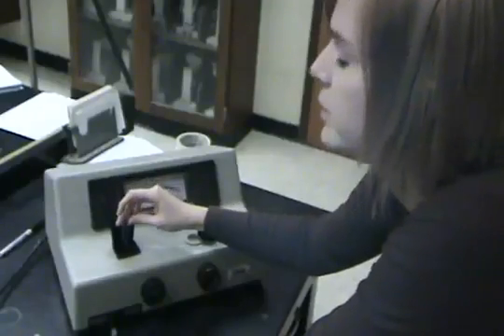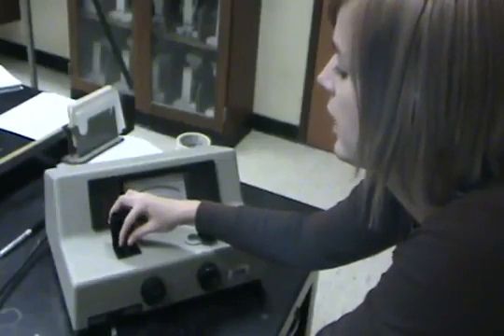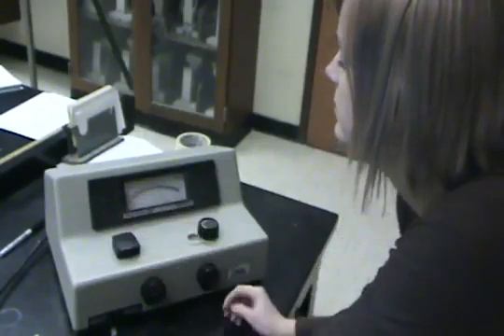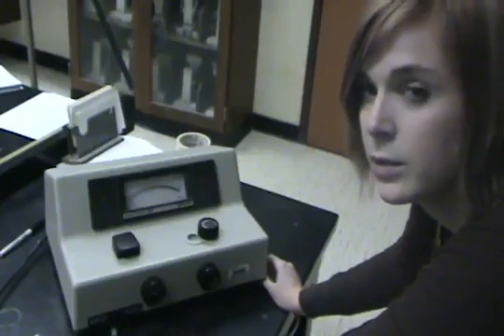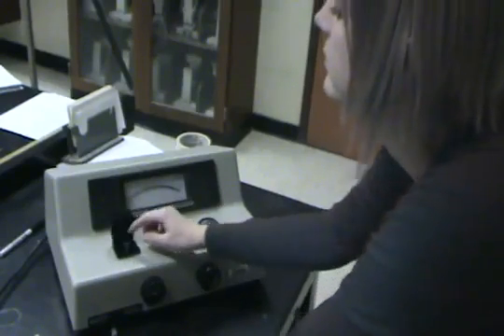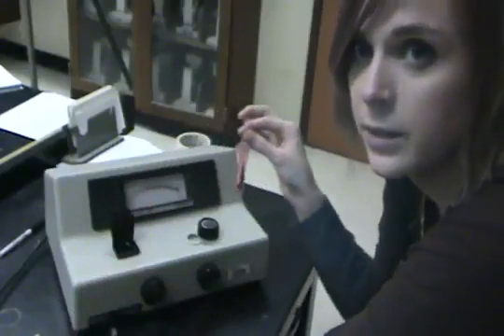These are our two experimental cuvettes. Place it in the spectrophotometer, remembering to line up the white line with the line on the spectrophotometer. The red line on the spectrophotometer will then move and we will be able to take the reading. We can then take our second reading.